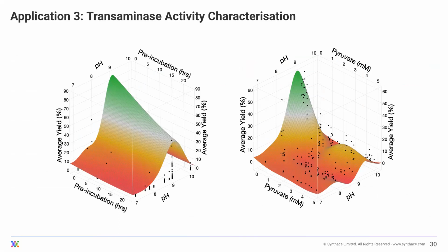But again, you need to use your scientific gut and intuition when you're looking at data like this to say, well, do we really think that these peaks and troughs over in the right-hand graph are real at the very base level? They could just be artifacts in the model. But of course, we can always come back and validate our model and use our model to predict new condition sets that we can run and then use to compare against our model prediction. And in this particular case, that's what we did.